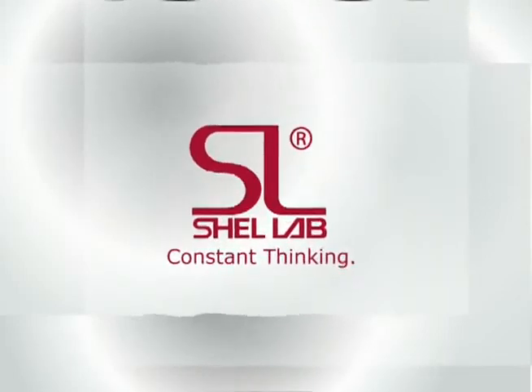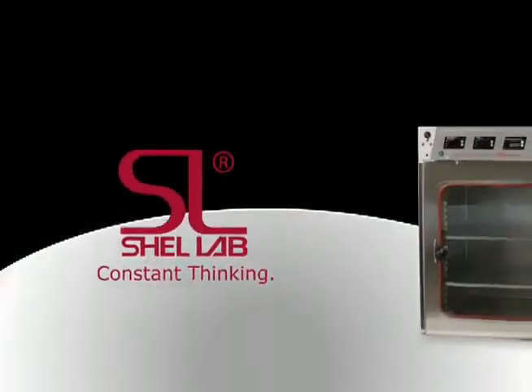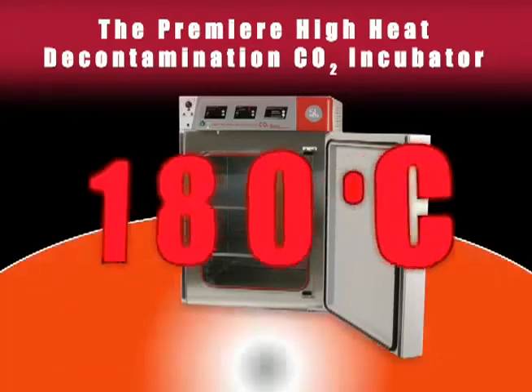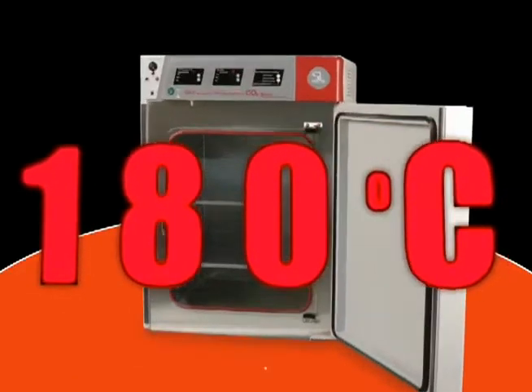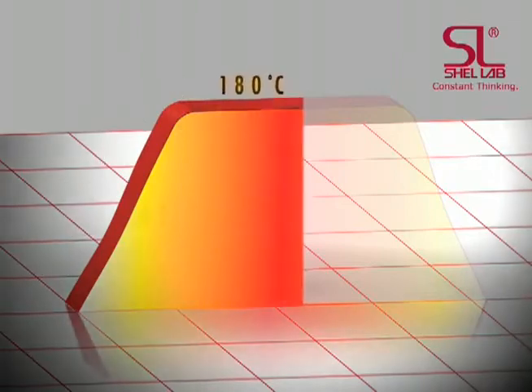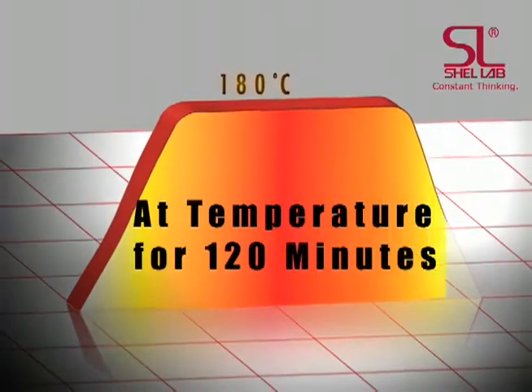This video will provide an overview of how to operate Shell Lab's Premier 3552 CO2 Incubator, including step-by-step instructions of its decontamination cycle. The all-new Shell Lab 3552 CO2 Incubator offers the latest in high-heat decontamination with a sustained decontamination temperature of 180 degrees Celsius for 120 minutes, and convenient design improvements such as eliminating any handling of the fragile infrared CO2 sensor.